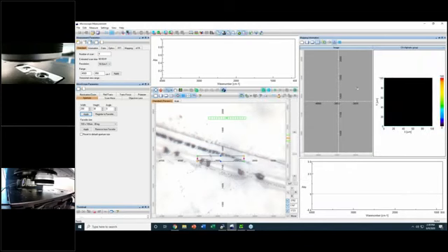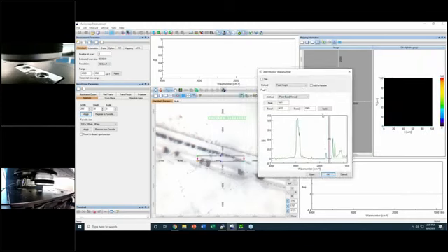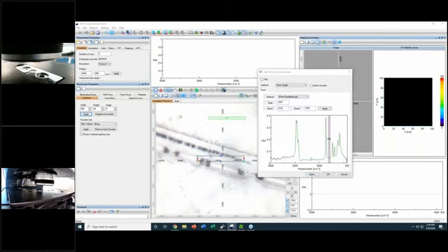And we click OK. The second that I want to show is the ester group, and I'm taking these measurements from a previous measurement of the same sample. So what I would like to show now is the creation of the maps while I'm doing the measurement.